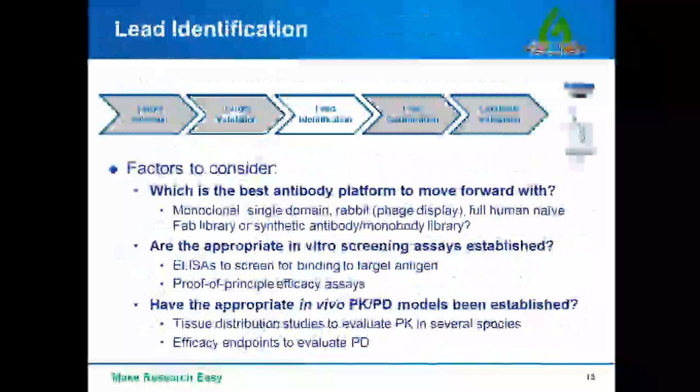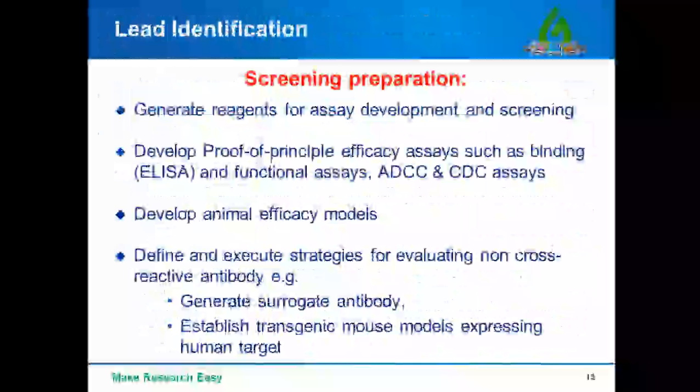Candidate antibody validation is certainly an important step for antibody drug development. Before a robust antibody validation can be performed, it may be necessary to scale up antibody production by generating stable cell lines. In vivo efficacy assays like syngeneic tumor models may be needed to test the efficacy of immuno-oncology antibody leads. Subcutaneous xenografts or orthotopic models may also be of use and require validation as reference drugs.